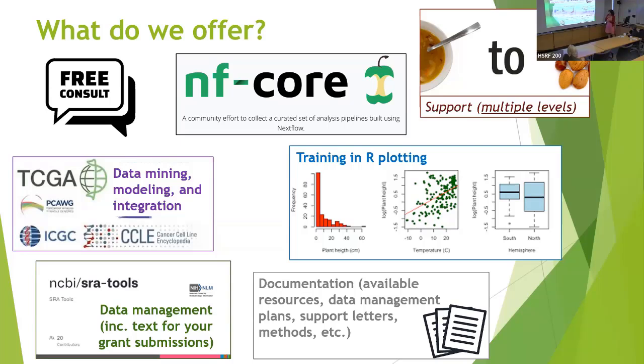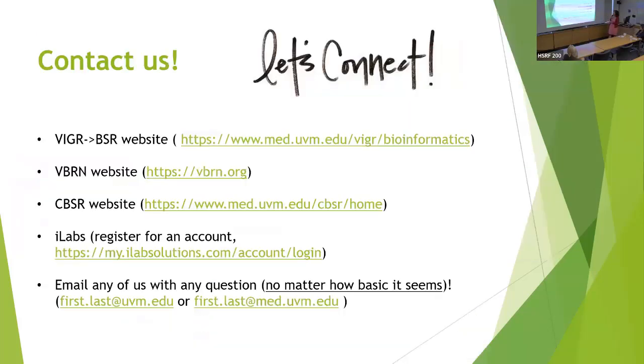You submit large amounts of data to the SRA and then document the work we've done. We don't post our outputs in iLabs as the other cores do, because they're usually too big. We create a web page. We send you a link to it. There are links in it to download your data from the back. A little bit different there.